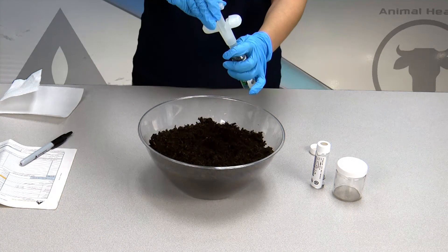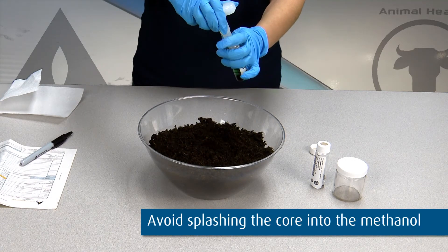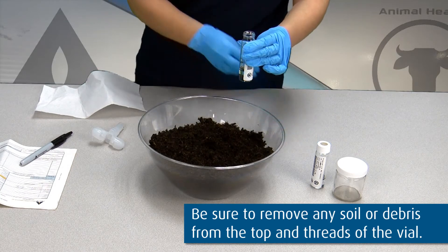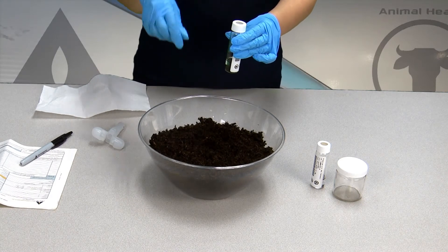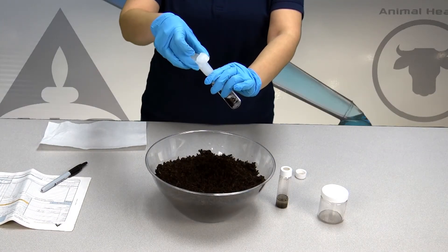Rotate the plunger 90 degrees. Push down on the plunger to slowly release the plug of soil into the vial. Remove the sampler and securely tighten the cap on the 40 milliliter VOA vial to ensure no leakage. Repeat the process for the second vial using the same plunger.